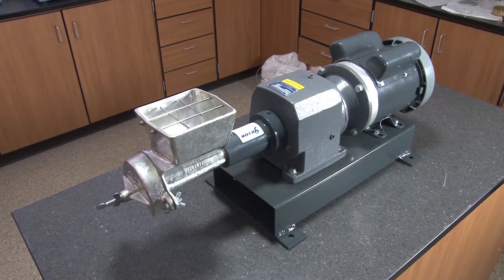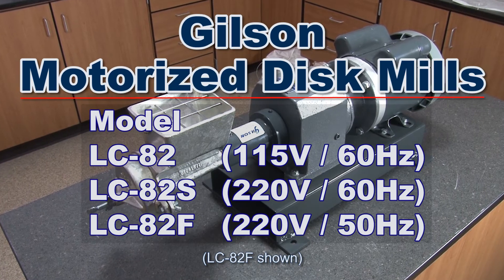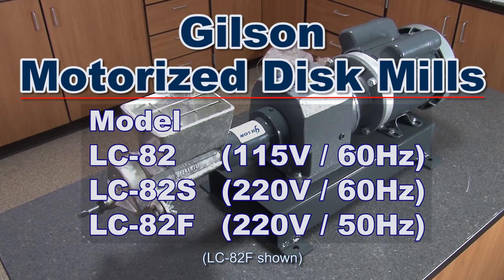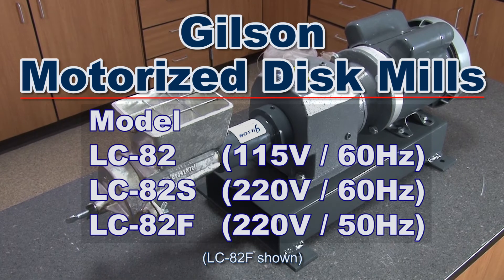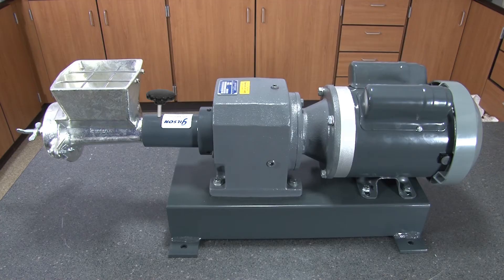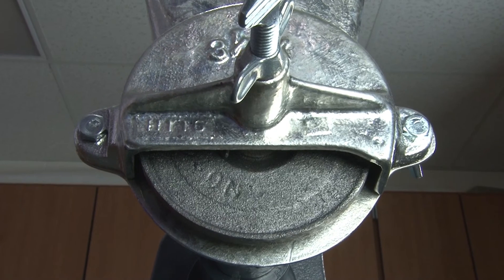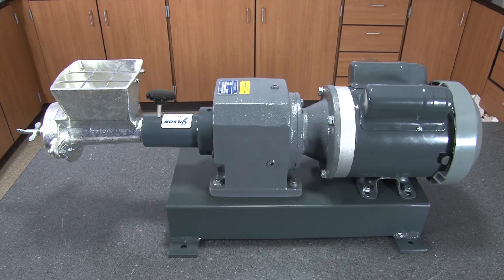Gilson offers several models to choose from, including the LC82 with its single-phase 115 volt motor, or the LC82F with its single-phase 220 volt motor. And the Gilson LCA 176 Dry Grinding Feeder and Disc Set with a precision grinding disc to mill materials to extra fine is included.